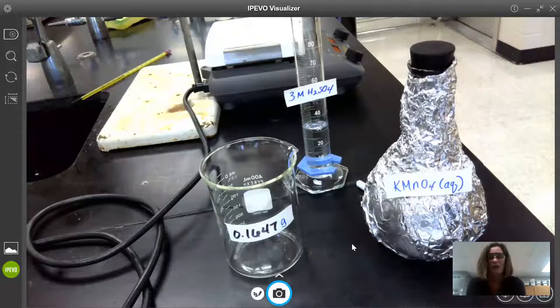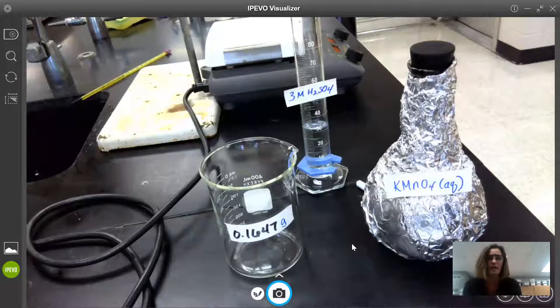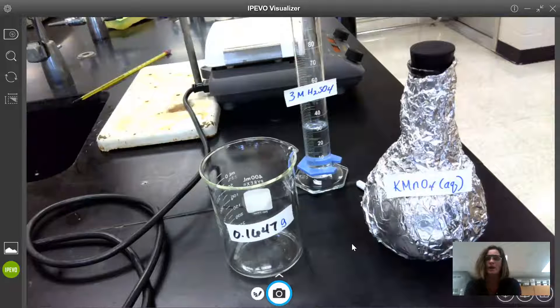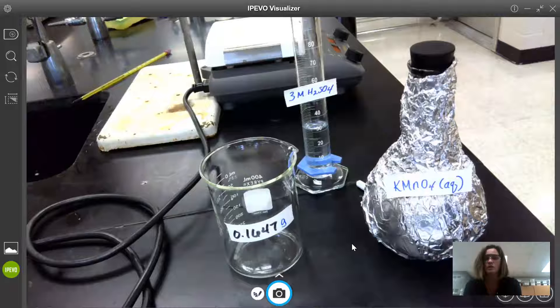I wanted an estimate of about how much sodium oxalate would I have to use in order to use about 25 milliliters of my KMnO4 solution.